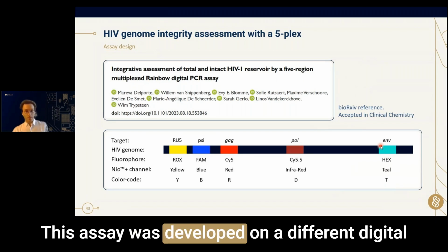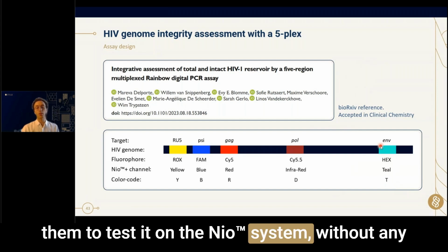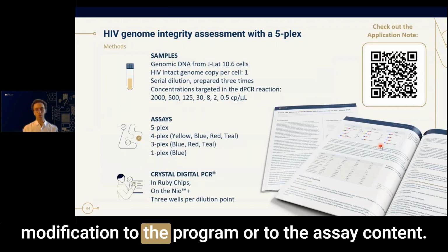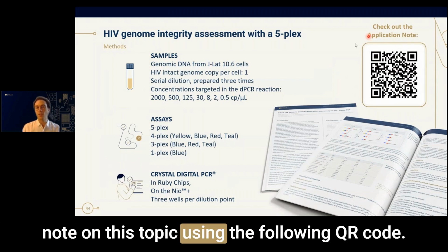This assay was developed on a different digital PCR platform, but we had the opportunity with them to test it on the Nio system without any modification to the program or to the assay content. If you are interested, you can find our application note on this topic using the following QR code.